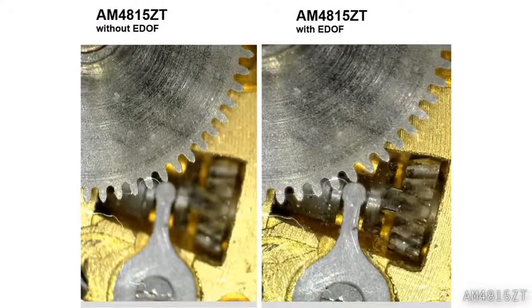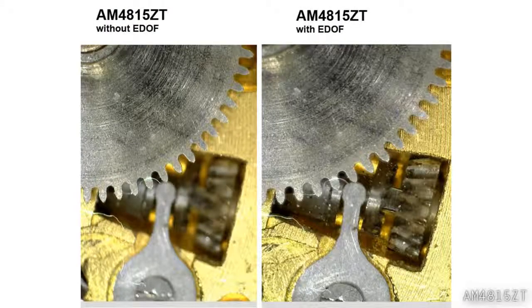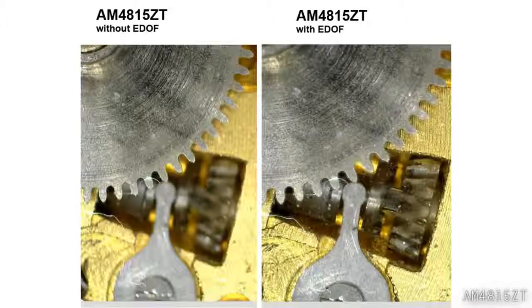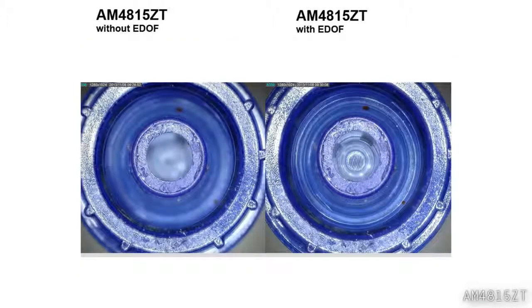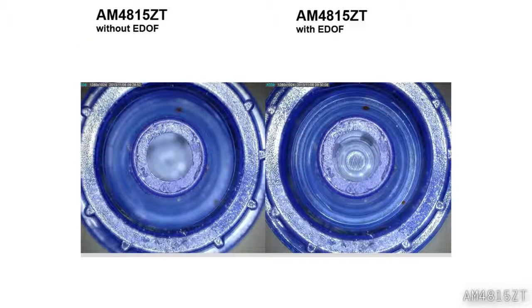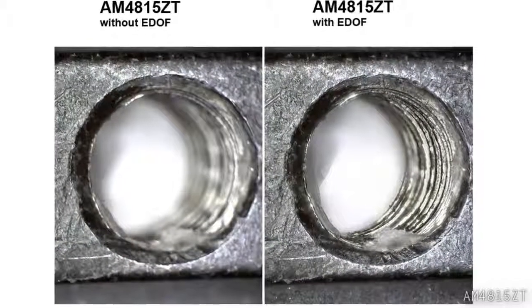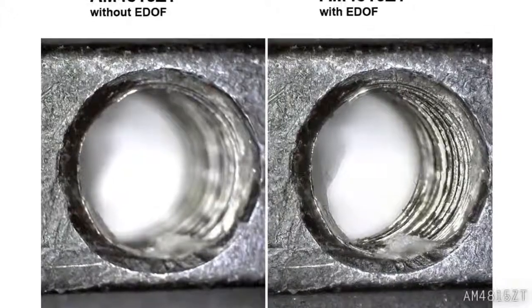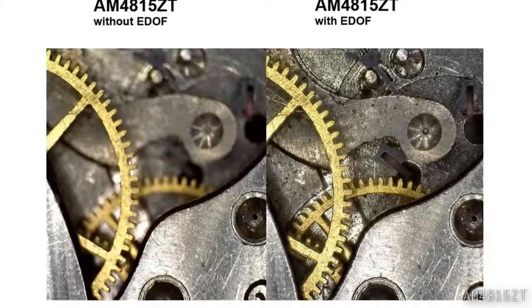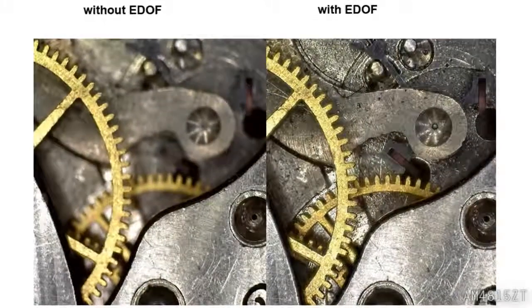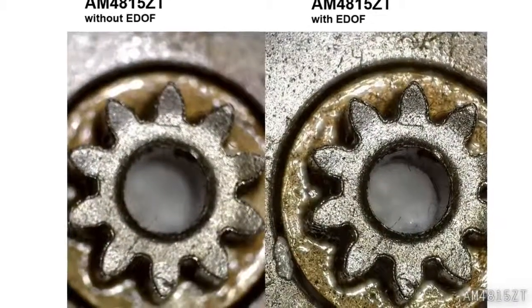Here are some comparison images with and without Extended Depth of Field.